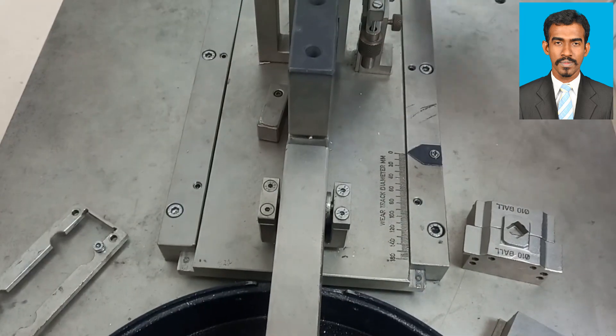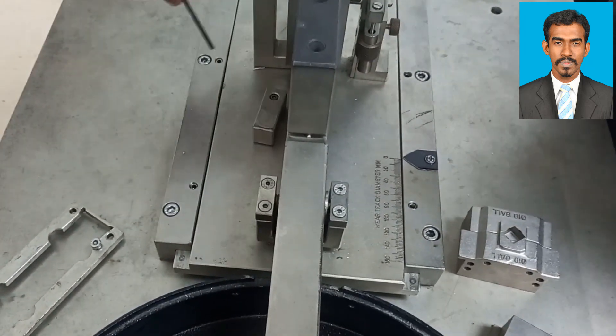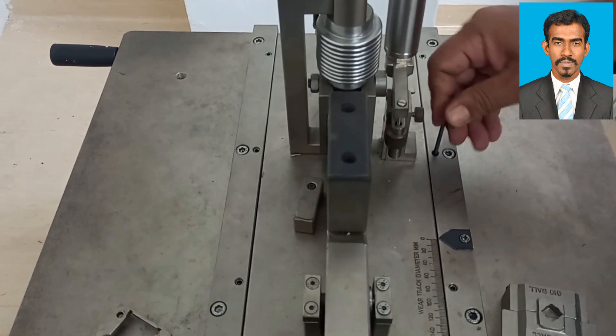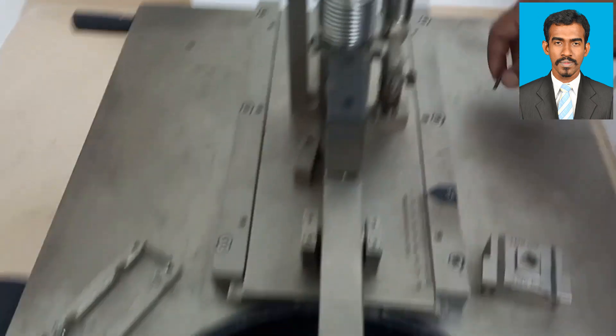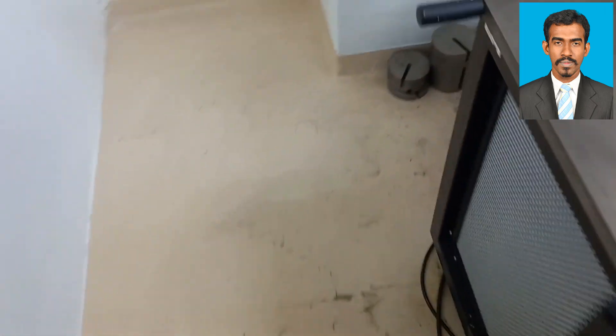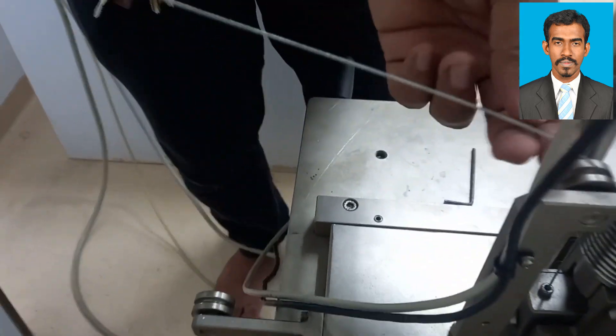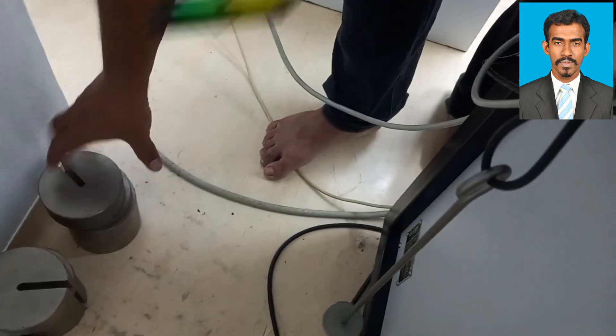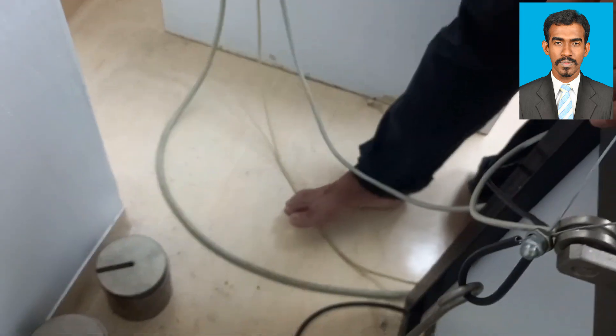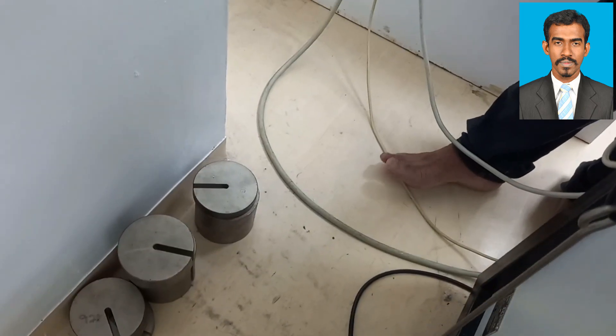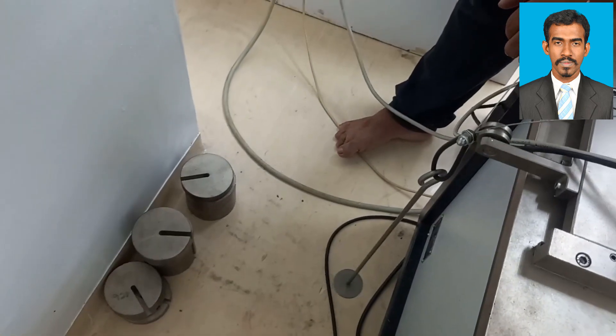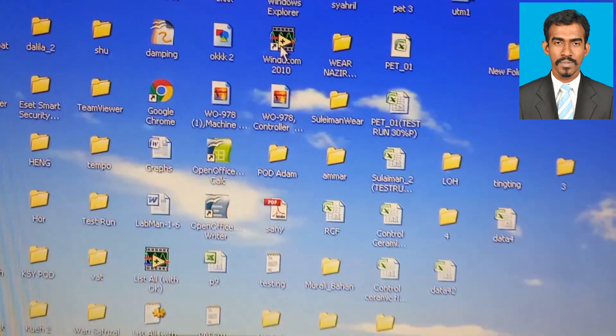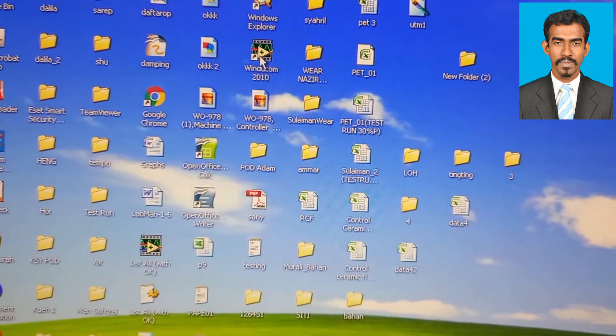The diameter or movement length can be adjusted by this scale. We have weights from 0.5 kilos to 2 kilos that we can add according to our requirement. When adding the weight, it is essential to make sure the string is passing above the pulleys. After setting up the specimen in the pin-on-disc tribometer, we will set the parameters in the software.